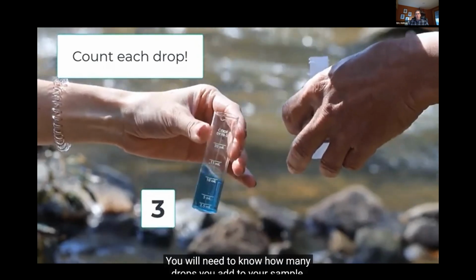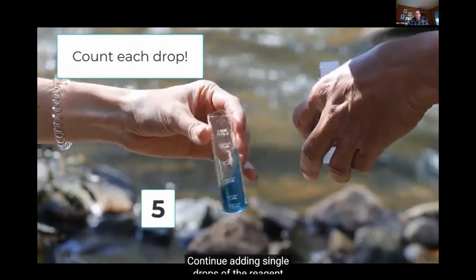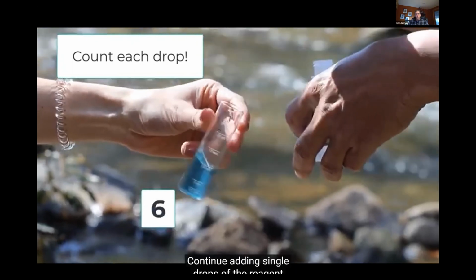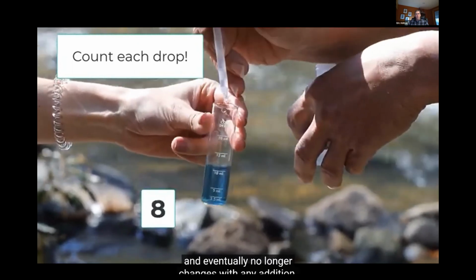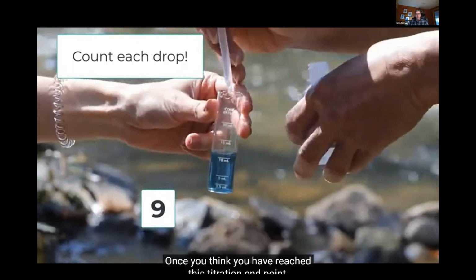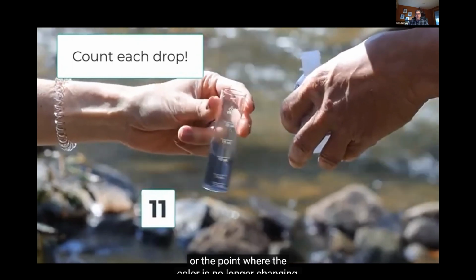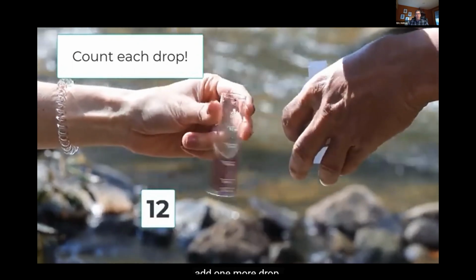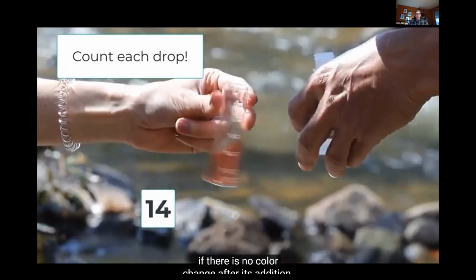You will need to know how many drops you add to your sample, so don't forget to count. Continue adding single drops of the reagent until the blue-green color changes to pink and eventually no longer changes with any addition. Once you think you have reached this titration endpoint, or the point where the color is no longer changing, add 1 more drop. Do not count the last drop if there is no color change after its addition.